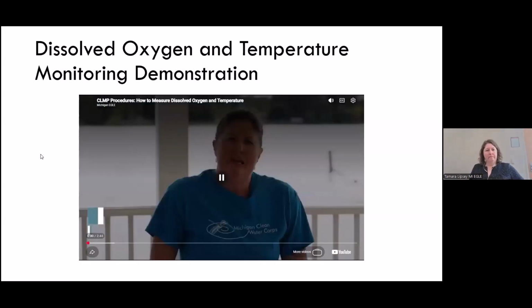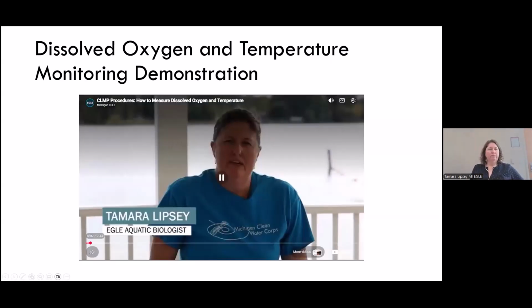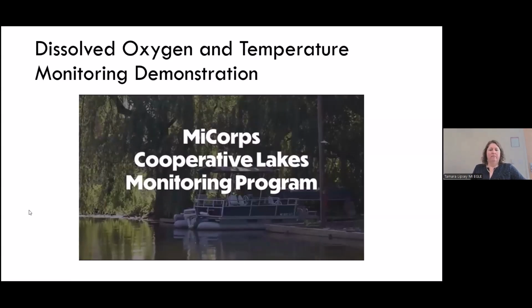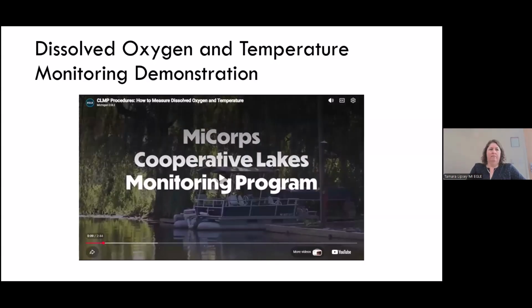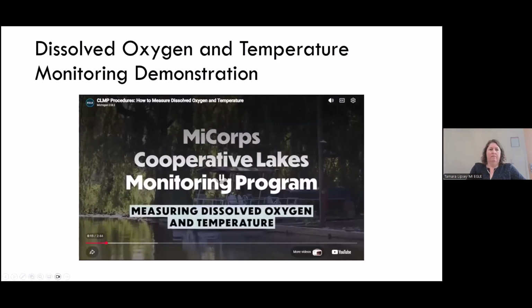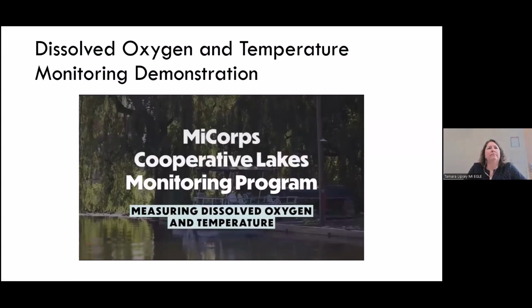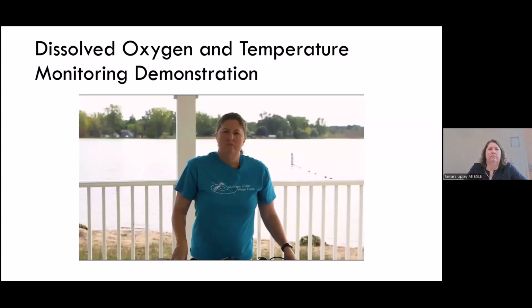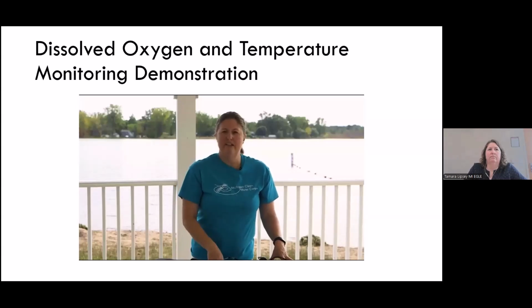Hello, my name is Tamara Lipsey, and I'm an aquatic biologist with the Michigan Department of Environment, Great Lakes, and Energy. Today we're going to demonstrate how to use a YSI Pro 20 meter to measure dissolved oxygen and temperature in lakes using the MiCorps Cooperative Lakes Monitoring Program procedures. Before heading out, please make sure you assemble the necessary equipment, including your data sheet, and fill out the data sheet, including the map of the lake at the bottom.